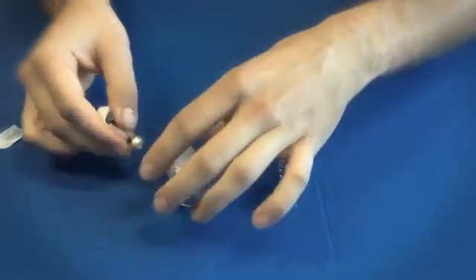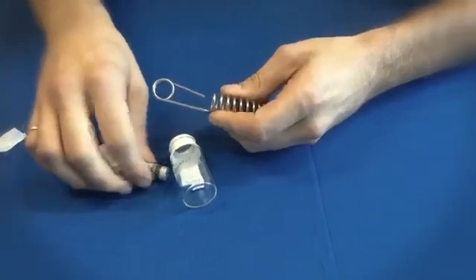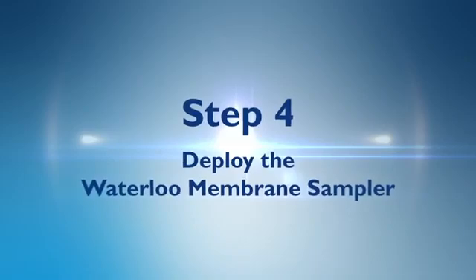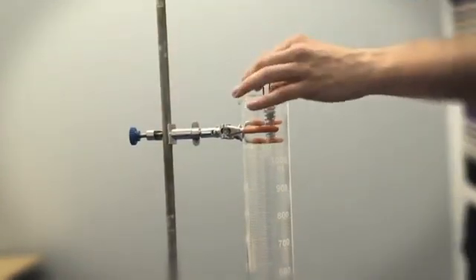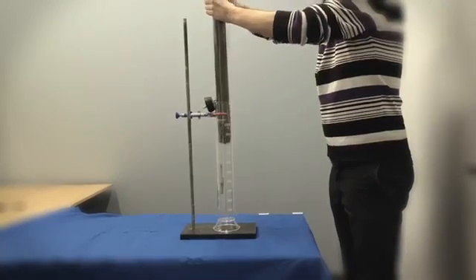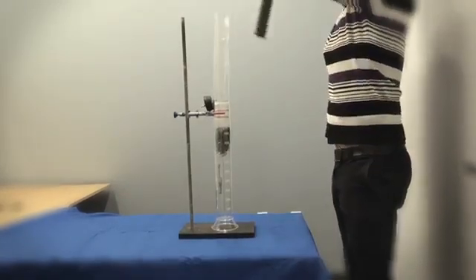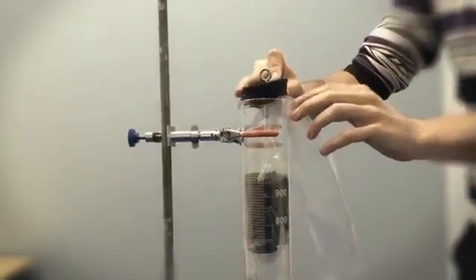The deployment sequence should not be interrupted. Insert the sampler upside down into the wire hanger. Lower the sampler into the borehole to the desired sampling depth. Lower the seal to about six inches above the sampler and use the dowel to push the foam from the pipe. When the foam expands, it forms a removable seal against the borehole wall. Remove the pipe and dowel from the borehole. Seal the borehole with the rubber stopper for the duration of the sampling.